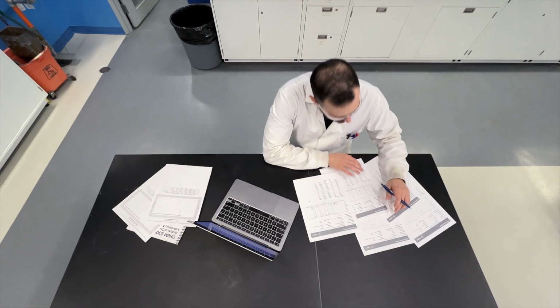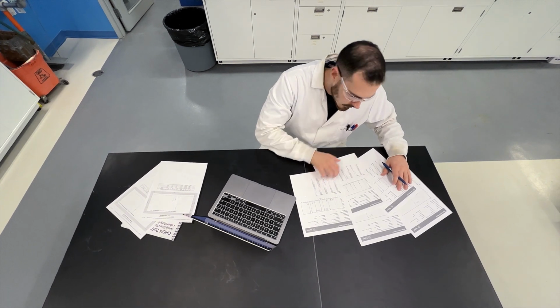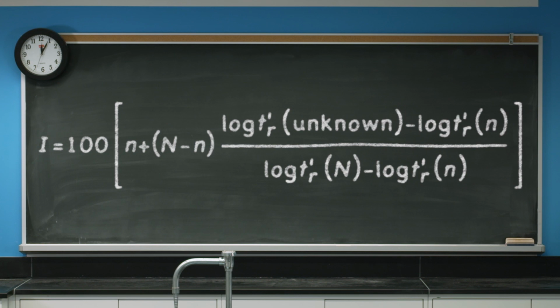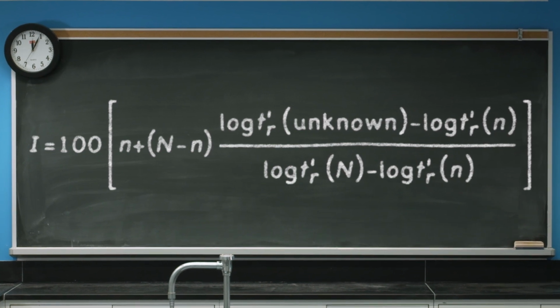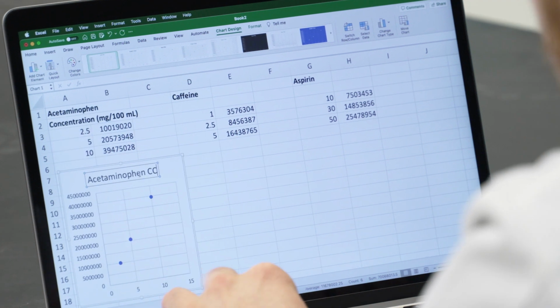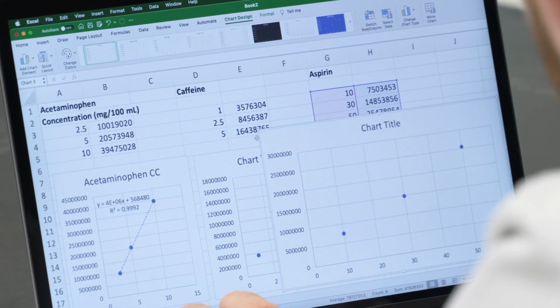Once all your data is collected, sample analytes can be assigned to chromatographic peaks. In Experiment 4, the number of carbon atoms comprising each alkane can be found using Kovats retention index. In Experiment 5, acetaminophen, aspirin, and caffeine calibration curves can be made to quantify them in your unknown analgesic tablet.